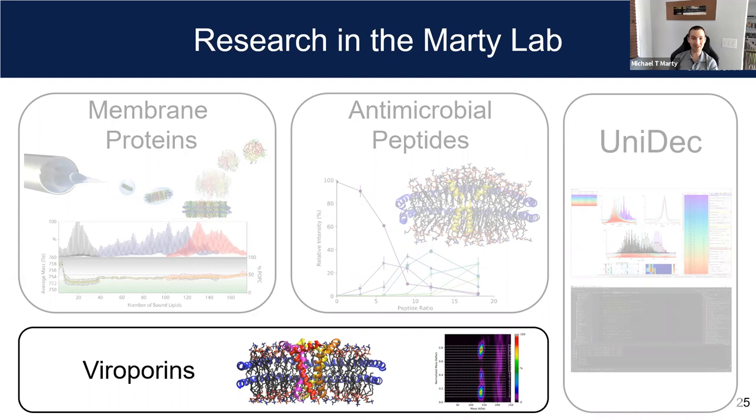And that's where we're at right now, trying to figure out how do we do some lipidomics to figure out, you know, it's not an obvious mass for what's bound. And so either that means we have a combination of things, or maybe we have a non-obvious lipid. We're trying to write up this paper with well-defined lipids, but I think our next direction is put in natural lipid mixtures and pop stuff out and see what sticks. But yeah, like I said, we have a lot of work to do on the informatics side. We can get beautiful data, but what does it mean is the main challenge there.